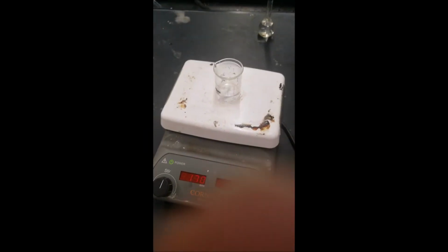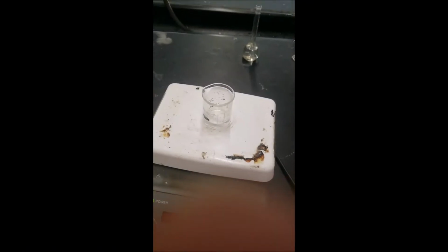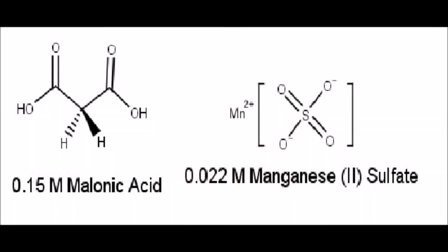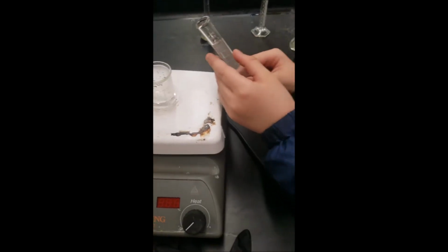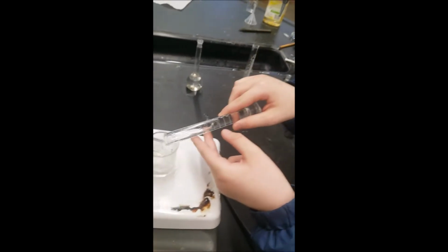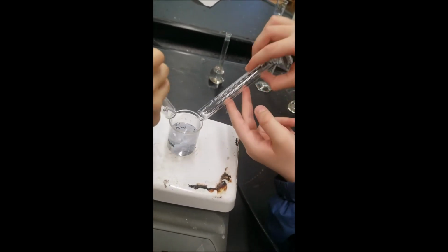Oscillation reaction. So we have boiled starch and hydrogen peroxide, and we're going to add malonic acid, manganese sulfate, potassium iodate, and sulfuric acid. You ready, guys? Okay, ready? Hold it up. Tip and pour. Sure, it's all of it.